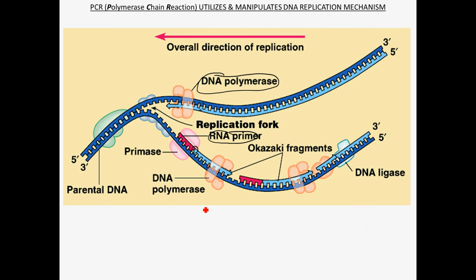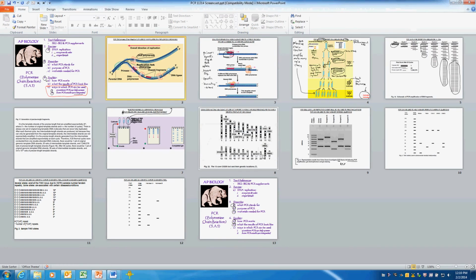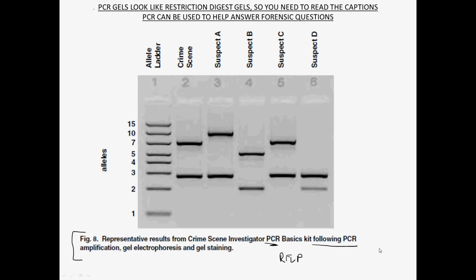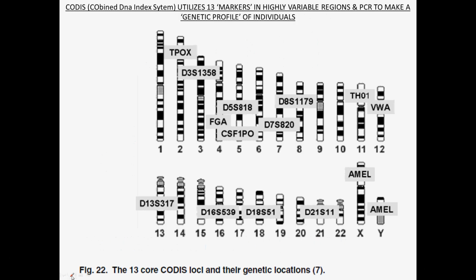The other screencast dealt with the procedures of PCR, what was happening over here, some visualization about what was happening in the tubes, and then a little bit about the electrophoresis. And we stopped looking at this slide, the interpretation of this. So let me back up a second.